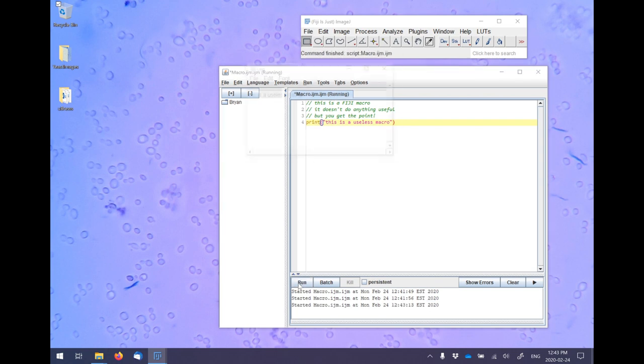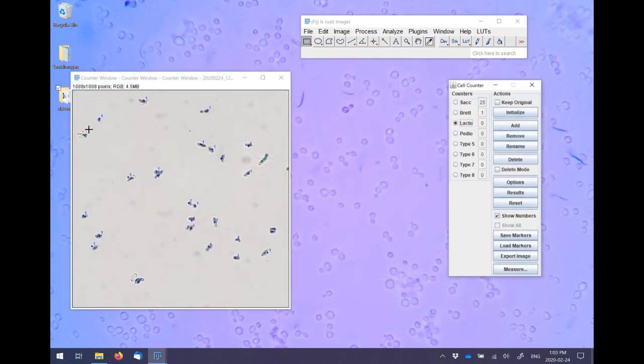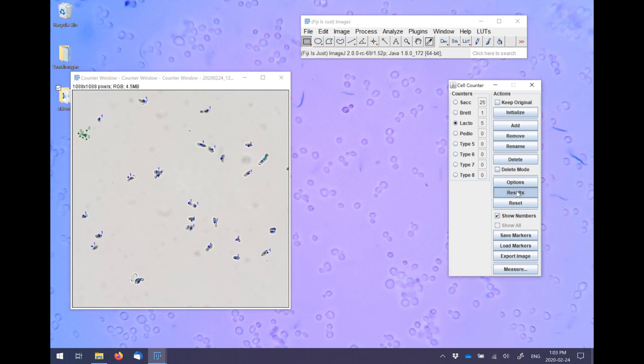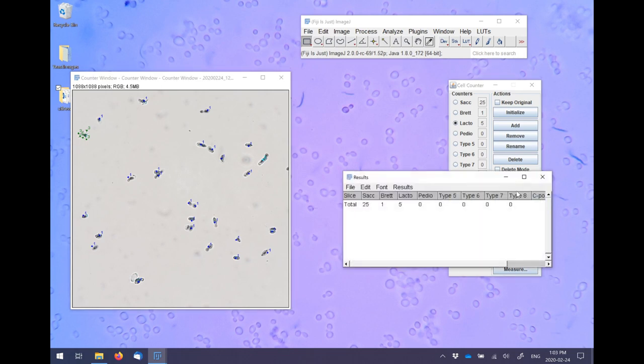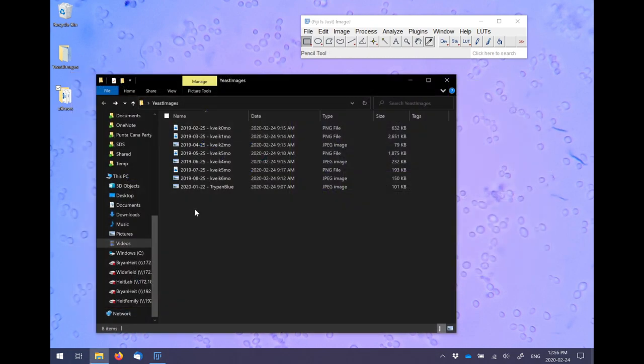In this example, I'm going to use an image of Trypan Blue Stained Yeast on a hemocytometer plus the cell counting plugin to count live versus dead yeast cells in a sample. This is obviously a simple version of what we could actually do with this particular plugin, but it will show you how this plugin works and how to use it properly.